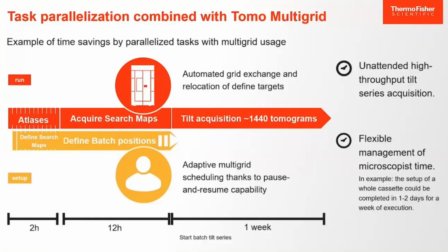I have to say, of course, it can be quite tedious to set up an experiment, because especially when you do Tomo multigrid, you can define a lot of experimental areas. So we have the possibility to pause and resume the setting up phase here. So flexible management of microscope time in that respect.